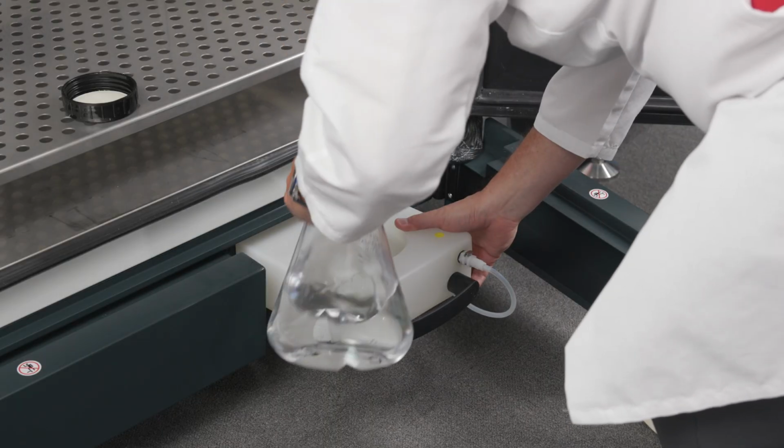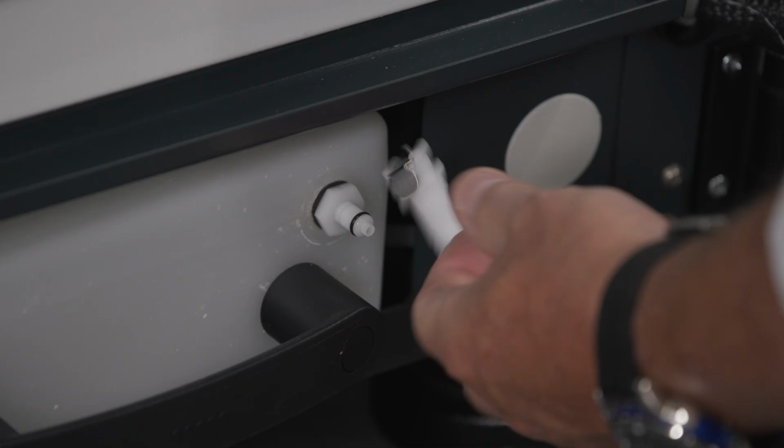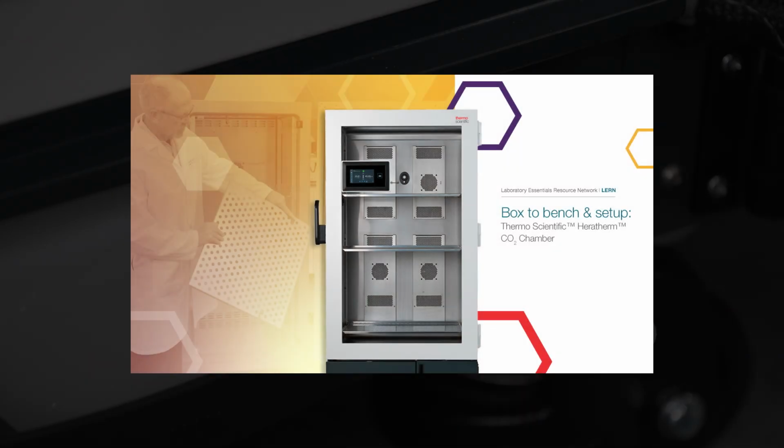We should also note that you can learn about setting up and managing the water supply and humidification system of your Heratherm CO2 chamber by watching our video about unpacking and assembling.